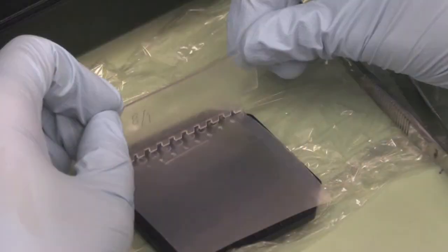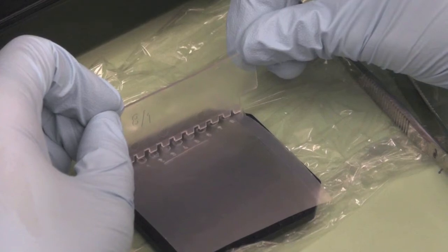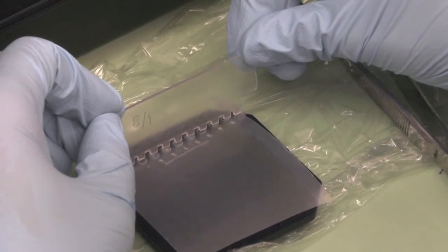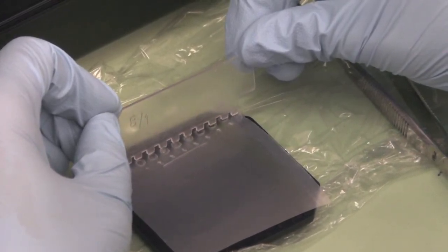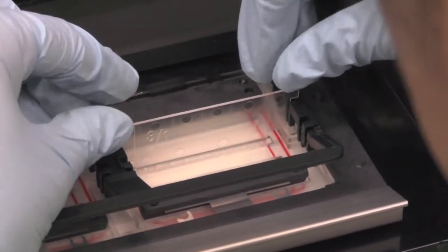Open the 8/1 sample applicator. This means 1 microliter for each of the 8 lanes. Gently touch the walls of the sample applicator to obtain samples. Gently put the comb in the middle slot. Make sure you do not touch the comb and press it down.